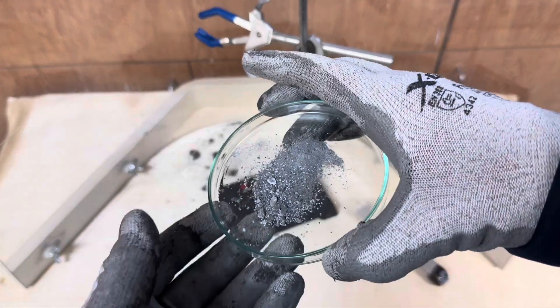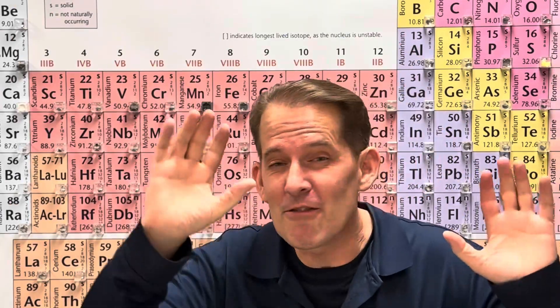It should look something like this. And now we're ready to create pyrophoric silane gas. In order to do this, I like to use a big 2,000 milliliter beaker to contain the sparks. Remember, silane gas is pyrophoric, meaning that it will spontaneously ignite when it's exposed to oxygen in the atmosphere. So we're going to add about 10 milliliters — just a tiny amount — of hydrochloric acid in the bottom of our beaker, and then we're going to sprinkle the magnesium silicide and it will react to make silane gas.